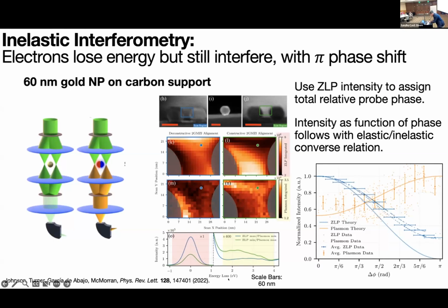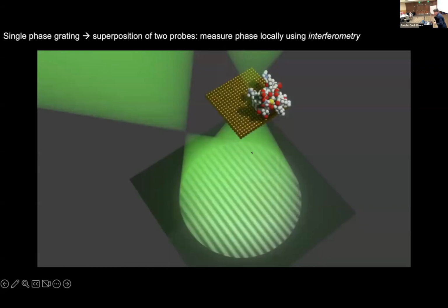Okay, I won't spend too much longer. I will say this is the ultimate goal: having a bunch of atoms, and you can focus the beams down to literally angstrom-sized length scales, and then use these tricks.